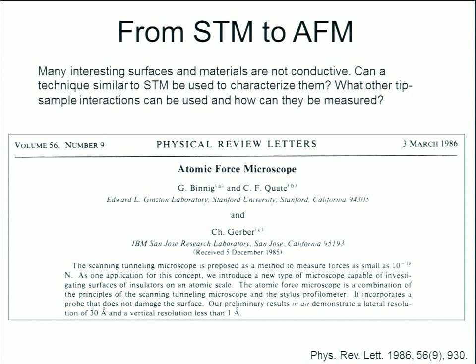So the question was, are there other tip sample interactions we could use, and how could we measure that interaction? And below is one of the first papers from Physical Review Letters introducing an early atomic force microscope.